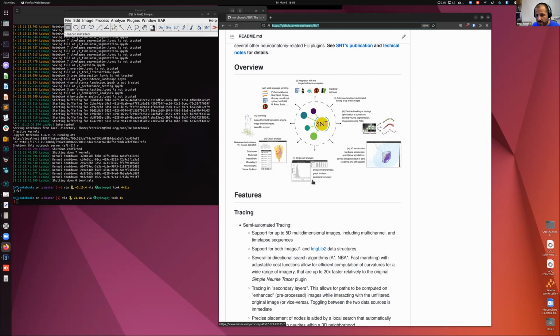More recently, it has the ability to also make direct statistical comparisons between cell groups, which is ultimately what most folks would be interested in, to compare different experimental conditions. It also has another component that's more related to my recent work here at Janelia, where you can use SNT to probe circuitry databases, whether it be the fly circuits in Drosophila, or MouseLight, or the project that I'm running now.